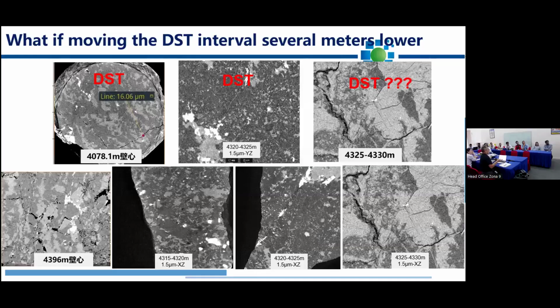This is another example. This is even deeper. If you look at the porosity of this one, this is granite. It's pretty obvious and it has very good porosity and permeability. I'm sure you're absolutely right. We have to look very carefully at which fractures are created by drilling operations, or even when you're handling the samples. It's not always easy. Sometimes we can tell the difference, but not all the time. I don't want to show that we are just too smart. No, it's difficult.